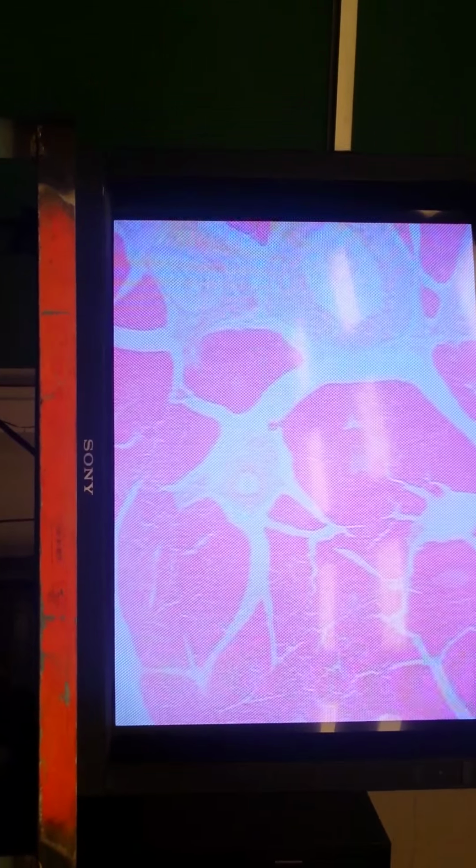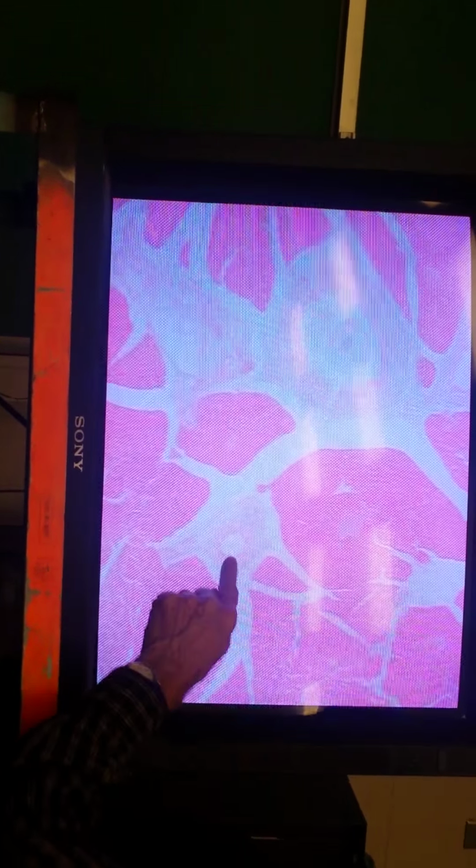Okay, what do we have here? That's a thymus gland. Not thymus. Pancreas. This is pancreas. Here's a key feature that tells you that. A couple of them, actually. This and this. What is that? Duct. Pancreatic duct. Pancreas is mostly an exocrine gland. Exocrine glands have ducts. None of the other ones have ducts. Just the pancreas. So if you see a duct, it's got to be the pancreas. None of the other endocrine glands have ducts. This is mostly an exocrine gland.